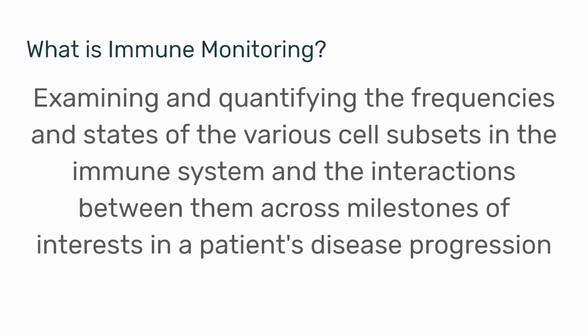In the previous presentation, I was talking about immune monitoring, and the idea with immune monitoring is that we track the different cell subsets in the immune system, examine their frequencies, their states, and the interactions between them in order to learn something about the progression of a disease in a given patient or a set of patients.